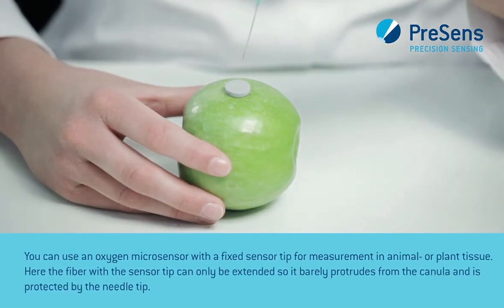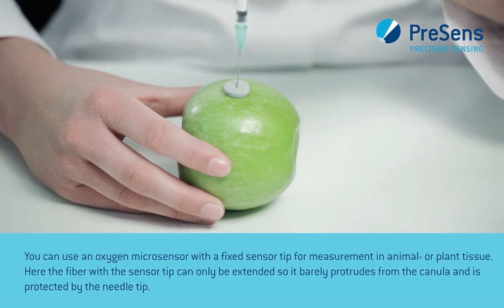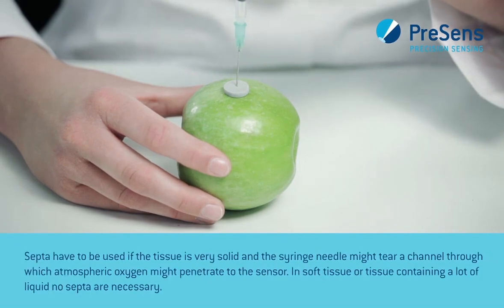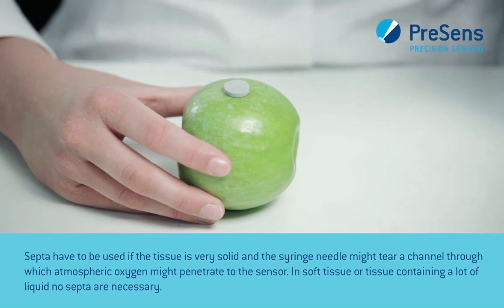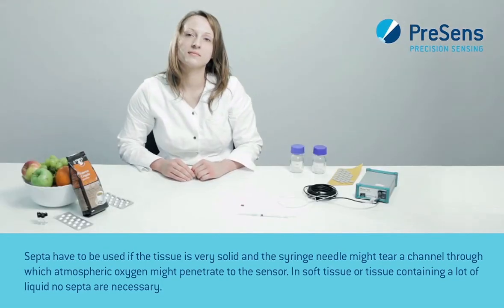You can use an oxygen microsensor with a fixed sensor tip for measurement in animal or plant tissue. The fiber with the sensor tip can only be extended so it barely protrudes from the cannula and is protected by the needle tip. Septa have to be used if the tissue is very solid and the syringe needle might tear a channel through which atmospheric oxygen might penetrate to the sensor.